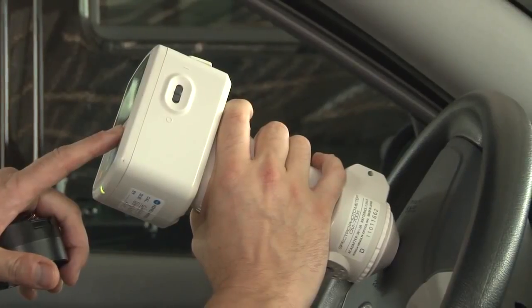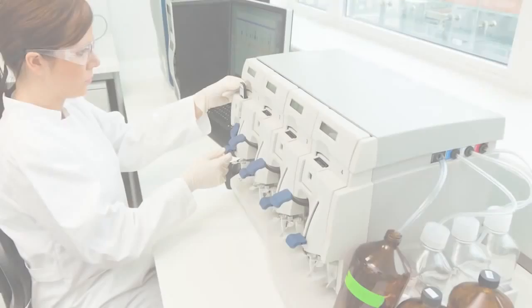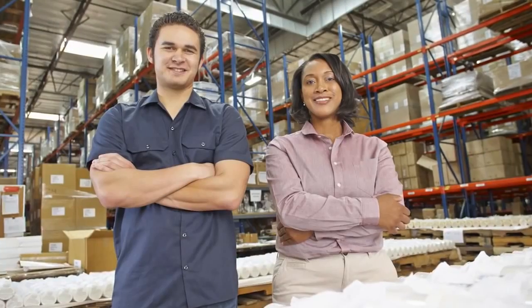The field-oriented CM700D is ideal for quality control, research and development, and the production line.